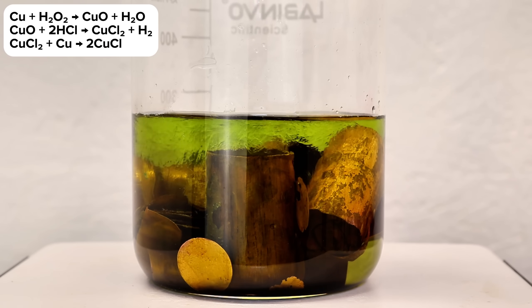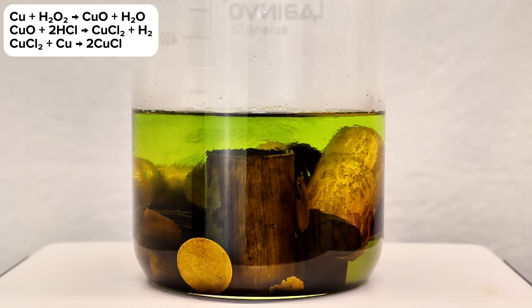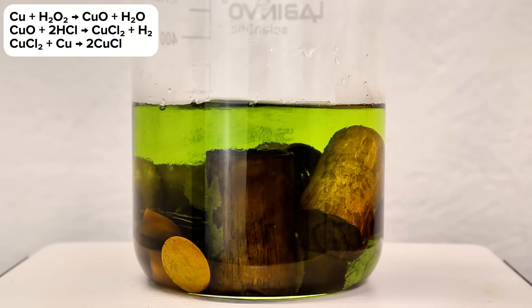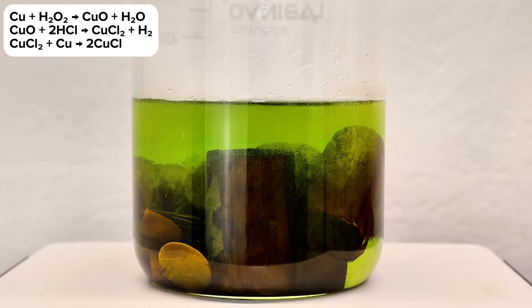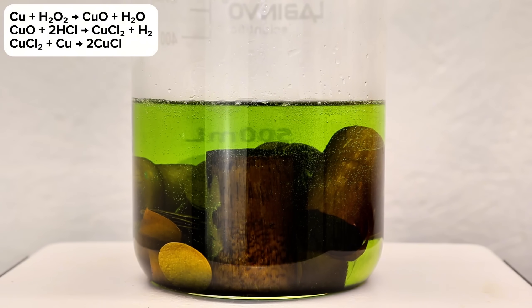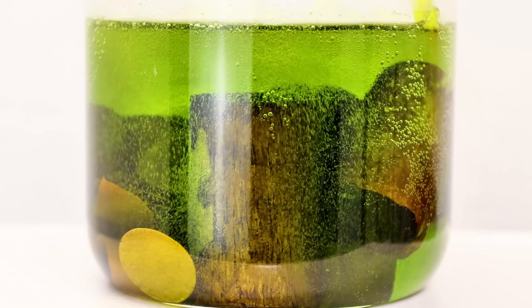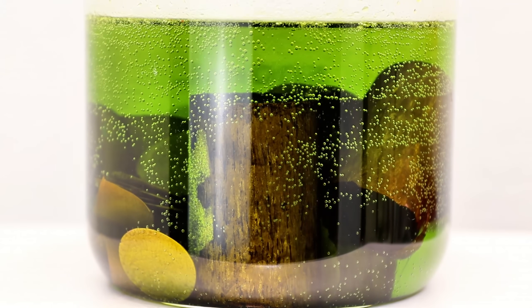You can see when the peroxide is added that the surface of the copper is quickly oxidized to black copper oxide. This copper oxide immediately dissolves in the hydrochloric acid, forming copper chloride. However, the large amount of excess copper present will eventually react with the green copper chloride forming two molecules of copper chloride, which appears a very dark brown in concentrated acid. As a result, the solution will quickly darken to the point of being nearly completely opaque.